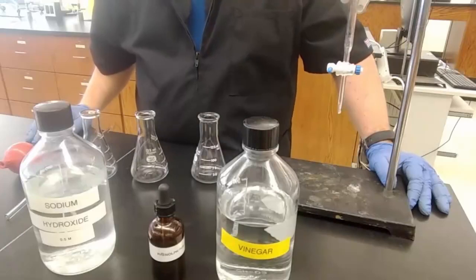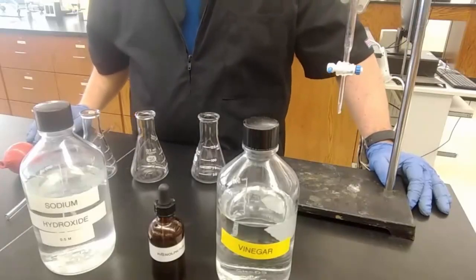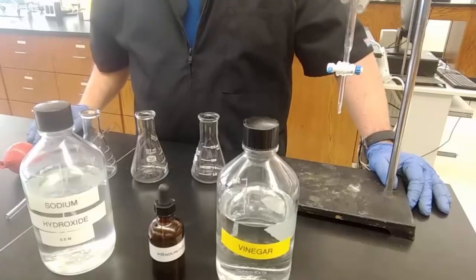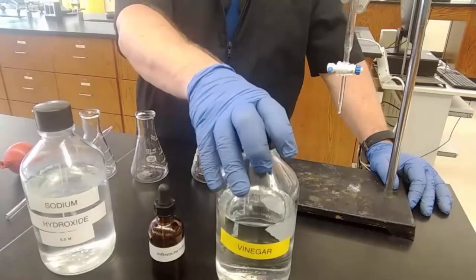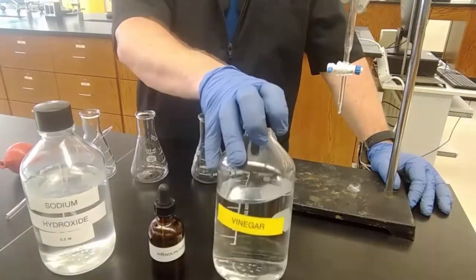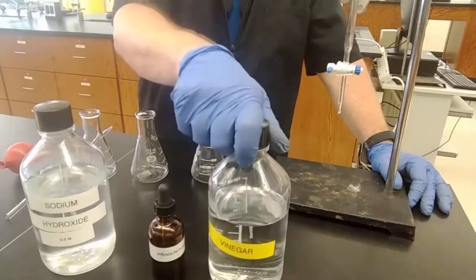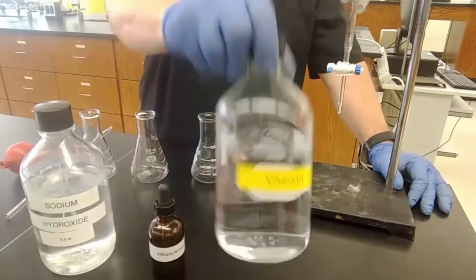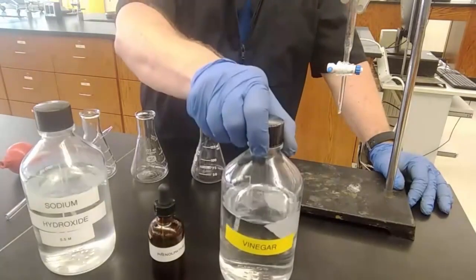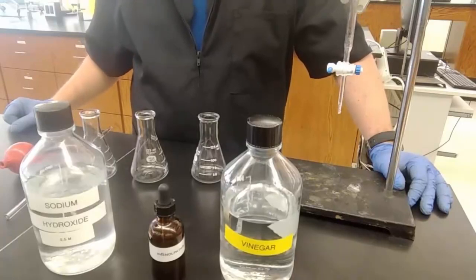Determination of solution concentration via titration works incredibly well. No anomalous, wacky results like the pH lab. This lab works incredibly well, and we're able to determine the percent of acid in a solution of vinegar, which you might have at home in salad dressing and so on. It's well known that vinegar is 5% by volume acetic acid, and we're going to be able to confirm that in this lab.